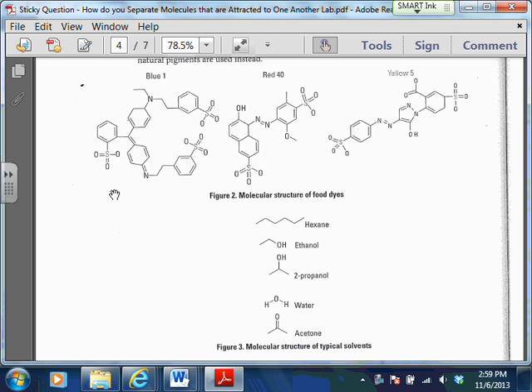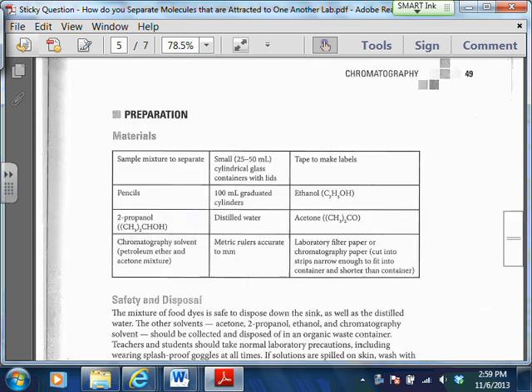So it has less LDF. It's less polarizable. Okay. And then you could maybe also mention that the blue has the three sulfite groups coming off of it, and the red only has two. But yeah, the red and the yellow are going to be close, but the red's a little bit smaller, so that's probably the tiebreaker there.